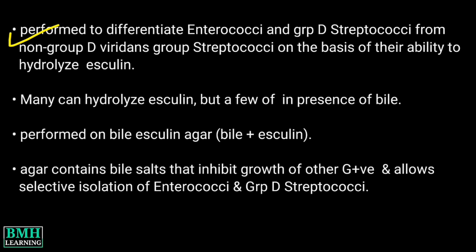This video is about the Bile Esculin test. The Bile Esculin test is a biochemical test performed to differentiate Enterococci and group D Streptococci from non-group D viridans group Streptococci on the basis of their ability to hydrolyze esculin.